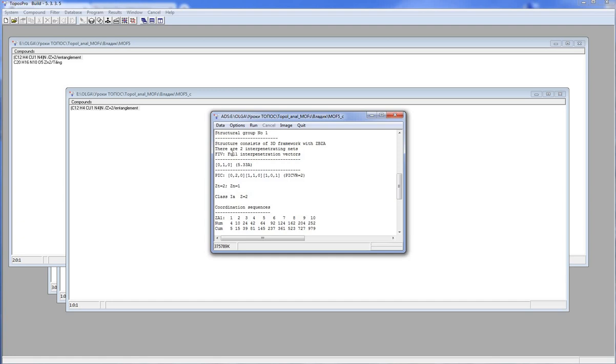If the net has any interpenetration, you will find the corresponding information in the output data. In the section Structure Group Analysis, you can see the composition of the framework, the number of the interpenetrating nets, the interpenetration parameters and the class of interpenetration.